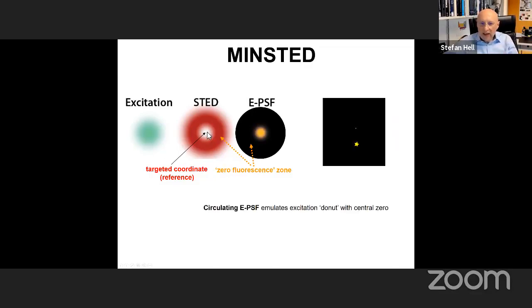And of course, taking advantage of the fact that the STED beam injects a coordinate in sample space that is very well defined. And the outcome of that was the concept MINSTED, which is related, of course, with MINFLUX. And I'm going to show you what the benefits of this concept are, the fundamental advantages.